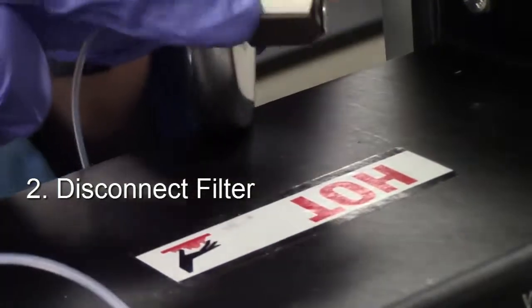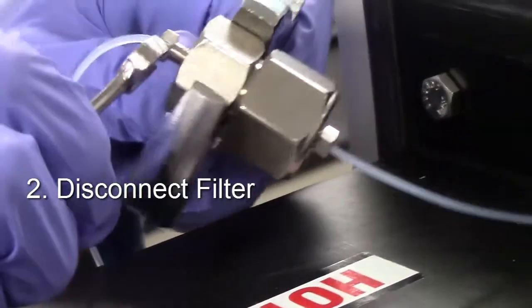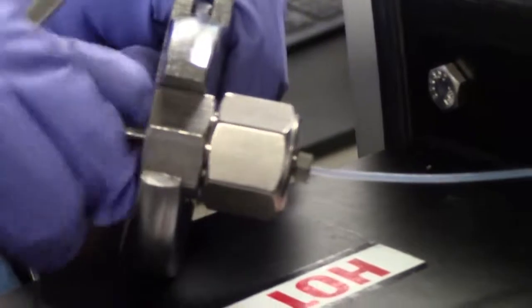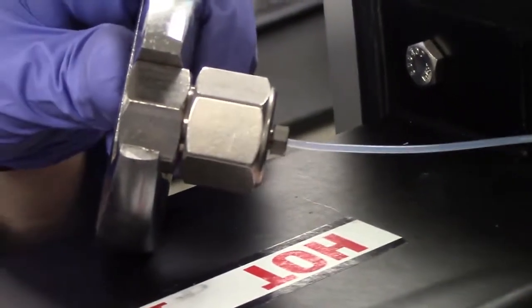Step 2. Disconnect the filter. Using a quarter-inch wrench, unhook both the inlet and outlet lines to the filter housing unit. Remember that the flows should already be off, so there should be no solvent leaks.